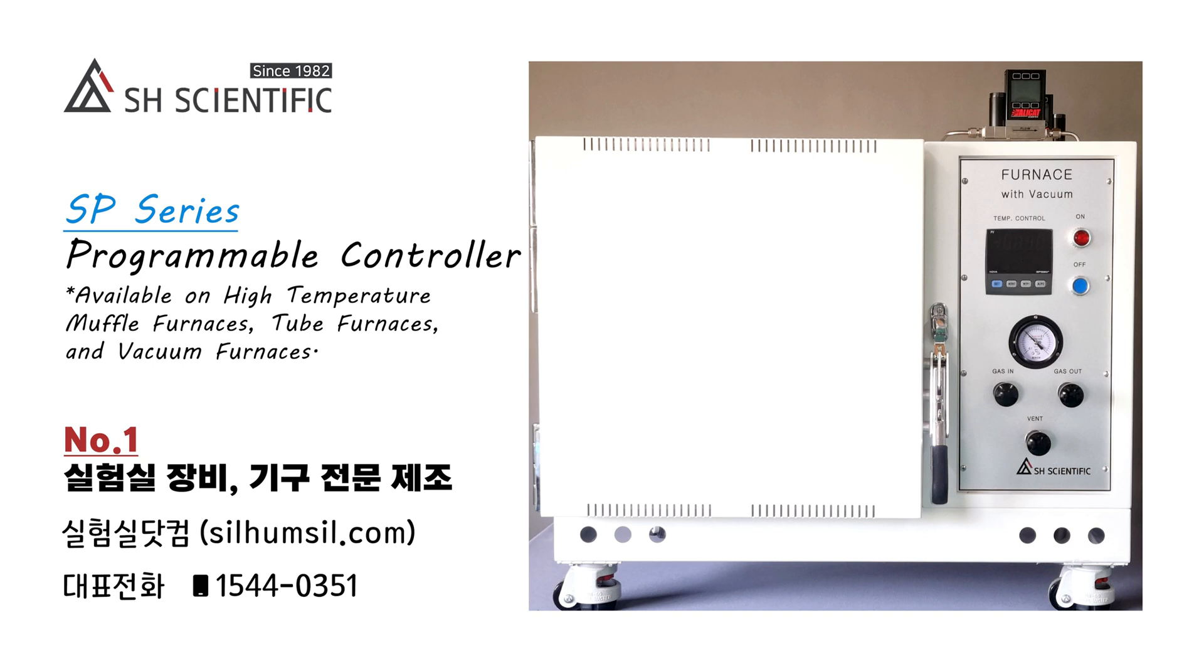This is the SP Series Programmable Controller from SH Scientific. We use this high-accuracy controller for our high-temperature muffle furnaces, tube furnaces, and vacuum furnaces. This video will explain how to set up this controller with ramp-up and hold programs of up to 30 steps between two patterns.